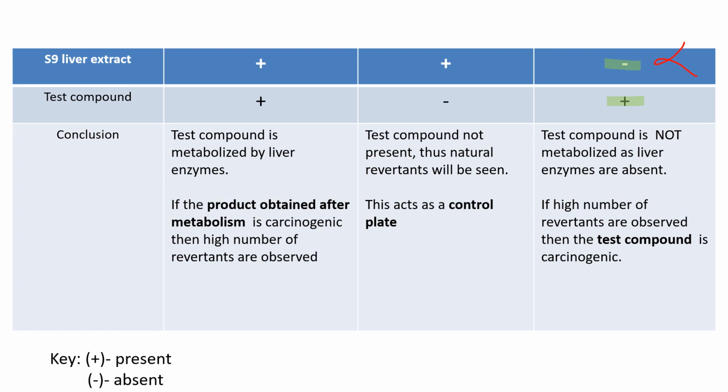If you get a high number of colonies here, then you can say that the test compound was also mutagenic or carcinogenic.